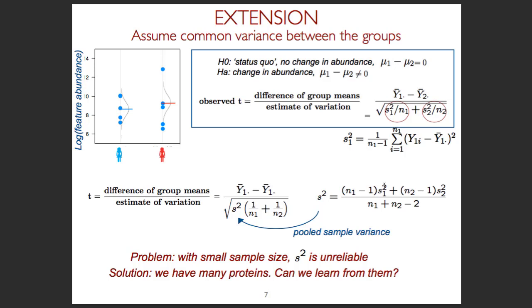I have seen the publication from the Bouliens. From the lab of Bouliens in Odense in Denmark. They have also published some code where you could use LIMMA and rank product. And afterwards, the p-values were adjusted, and in the volcano plot, not all the dots moved away from the 0 axis. And I tried it on my own data. It was a heavily regulated data set that moved even more away from the 0 axis. Do you have any idea?